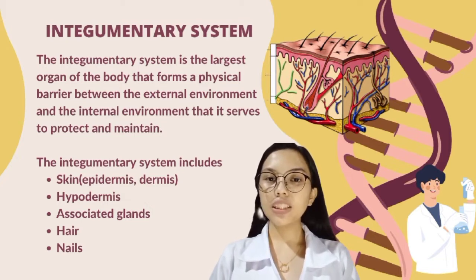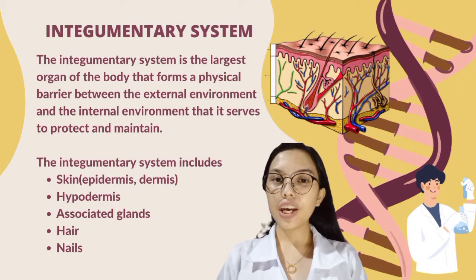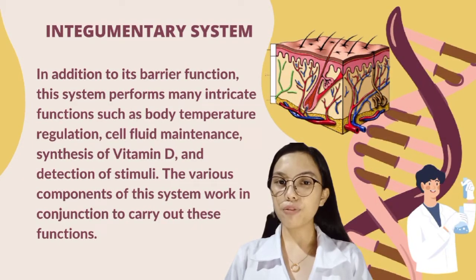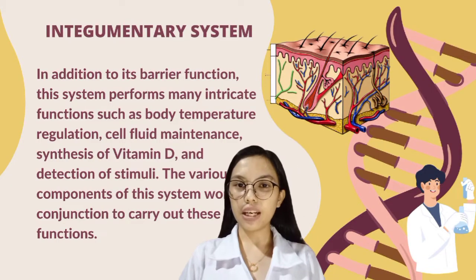The integumentary system includes skin, epidermis, dermis, hypodermis, associated glands, hair, and nails. In addition to its barrier function, this system performs many intricate functions such as body temperature regulation, cell fluid maintenance, synthesis of vitamin D, and detection of stimuli.